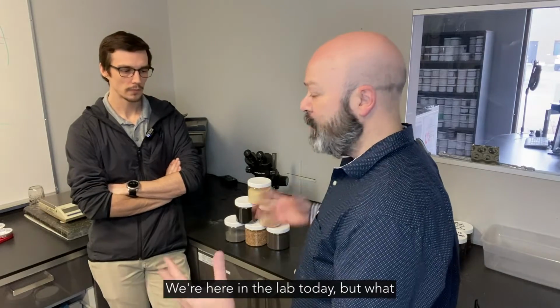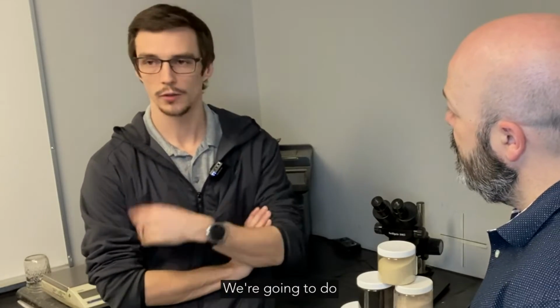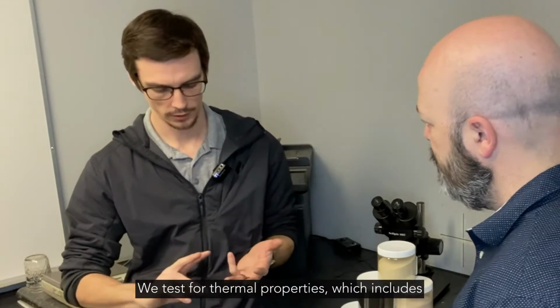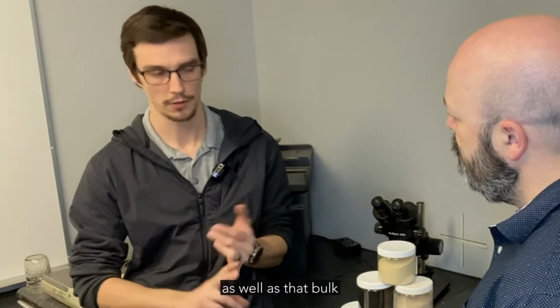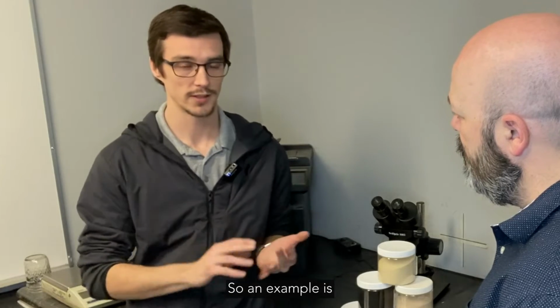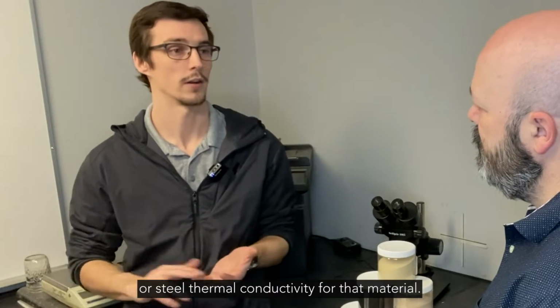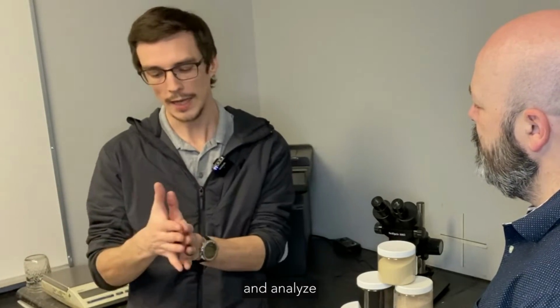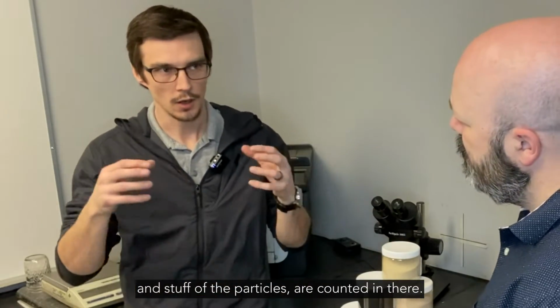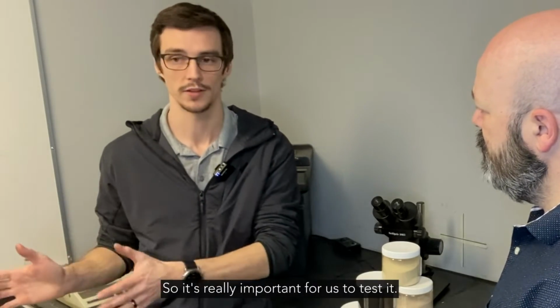Perfect. Now, how do we lab test? We're here in the lab today, but what are some examples? So lab testing, we do a number of tests. We're going to do flow testing, as I mentioned, is probably the most important one. We test for thermal properties, which includes the specific heat capacity of the material, as well as the bulk thermal conductivity, which is different from the regular solid conductivity. An example is if we had steel ball bearings, I couldn't use the stainless steel or steel thermal conductivity for that material. We need to do a practical test and analyze how the effective material, including all the shapes and stuff of the particles, are counted in there so you get an effective conductivity. And that's something that our customers almost never have, so it's really important for us to test it.